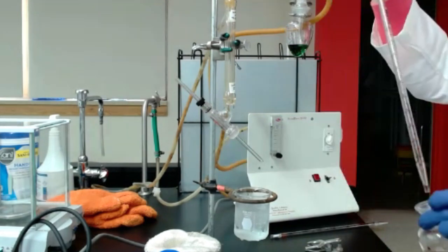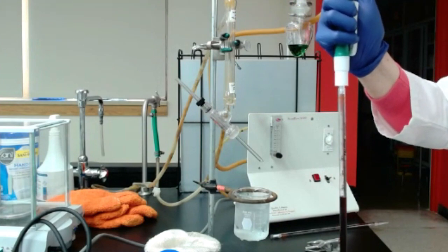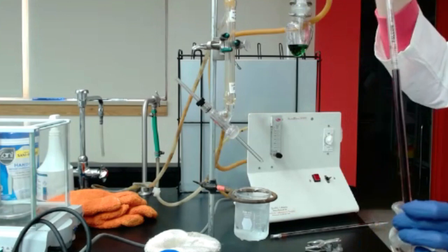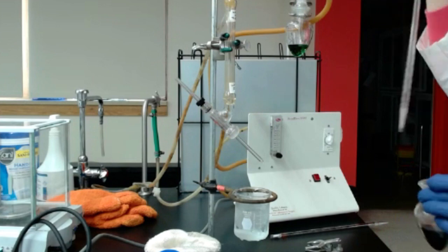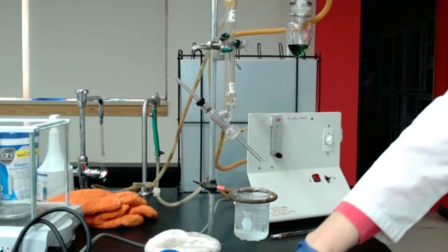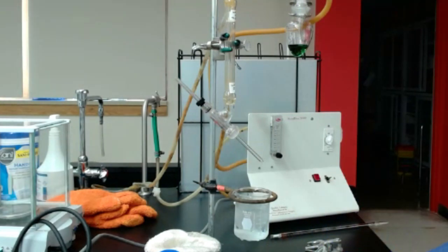In this step, you should be pretty quick, because what we want is to evaluate how much free SO2 we have, which is pretty volatile. If you wait too long, you're going to lose a little bit of sulfur dioxide. So make sure you do it quick. And quick is not a matter of seconds, but more of minutes. So don't wait like 15 minutes before finishing everything.